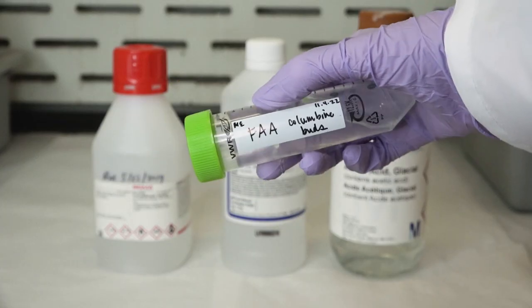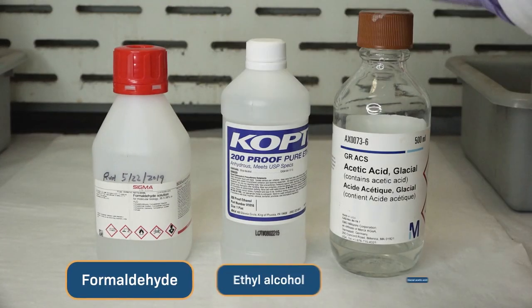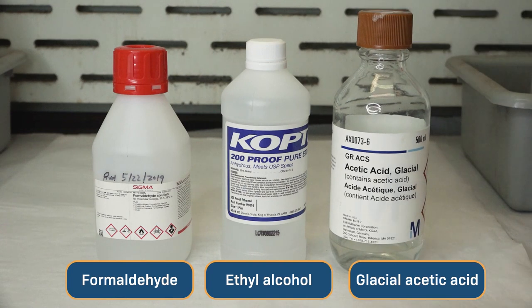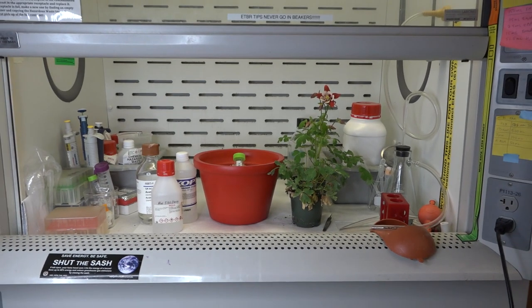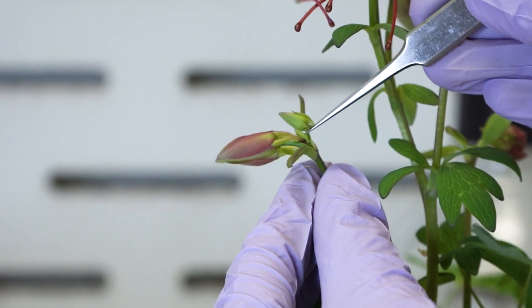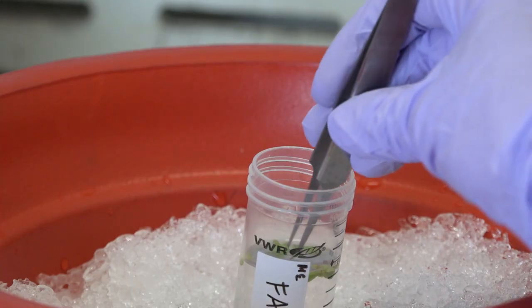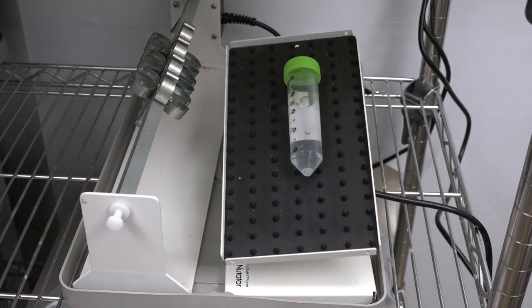our flower buds. To fix my flower buds, I'll be using a chemical called FAA, which is a mixture of formaldehyde, alcohol, and acetic acid. But there are lots of different fixatives out there. Fixatives are usually quite toxic, so I'm doing this step in the fume hood, and I've put my FAA on ice because cold temperatures help preserve the tissue better. Then all I have to do is pick some flower buds and throw them in. I'll let my buds shake overnight in cold FAA to make sure they're nice and preserved.